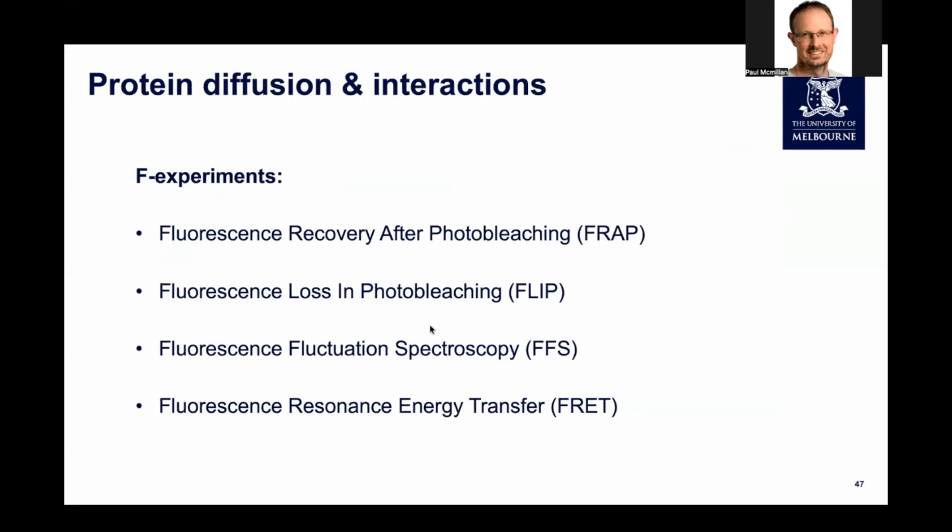All right, I also mentioned protein diffusion and interactions. We've mentioned the F experiments, which we're kind of grouping together based on the first letter of the acronym. So there's a few of those which we'll go through over the next few slides in detail.